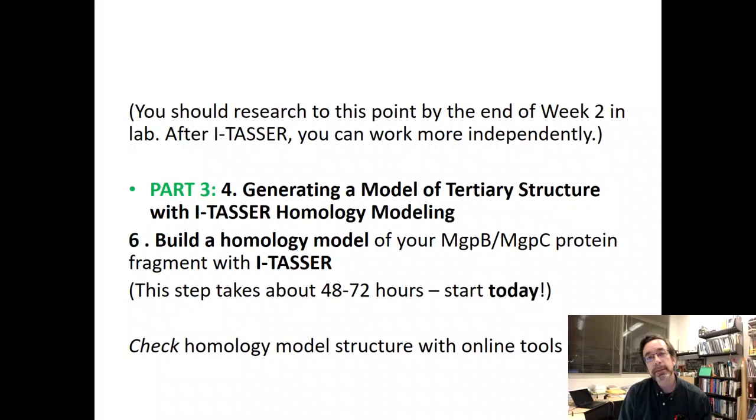Get to the protein design part. Talk with us about it, and even if you don't finish the previous part with all the primary sequence analysis, make sure you go ahead and paste it in and go forward with building the homology model. What it will do is take all those residues and model them out down to the atoms, and it will allow them to move around.